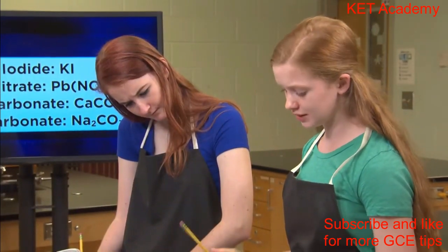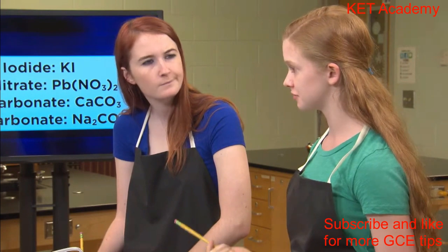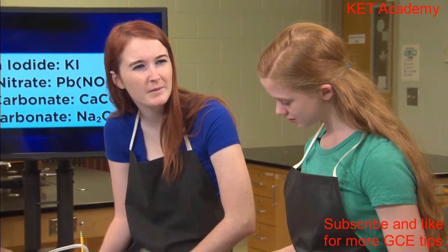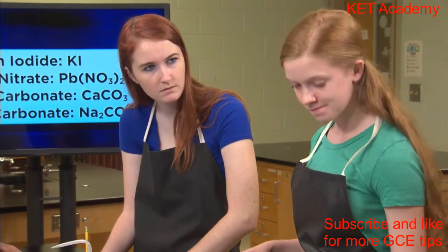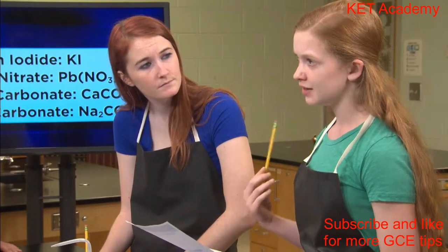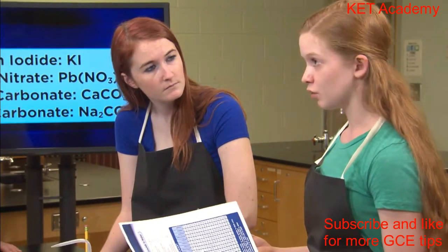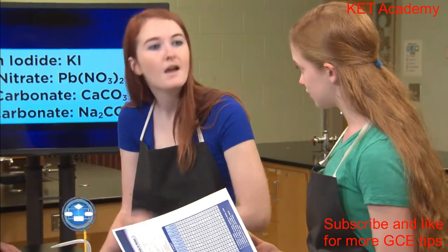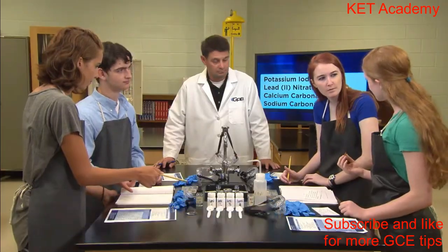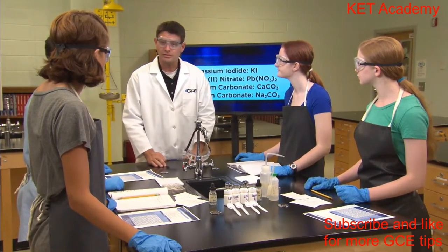The last test uses lead(II) nitrate. Isn't lead(II) nitrate one of our 4 powder samples? How does that help us? Well, it sure is one of our powder samples, but maybe it does something with the other unknowns. I looked at the solubility of lead. Lead(II) iodide is insoluble, so this test will help us figure out which unknown is potassium iodide. I sort of get how we can use these tests, but how can we figure out what order to do them in? Okay, guys, now that I've approved of your procedure, you can go ahead and begin.